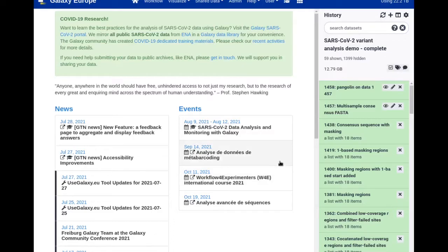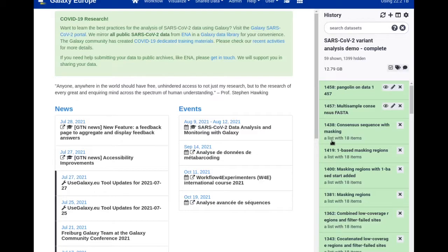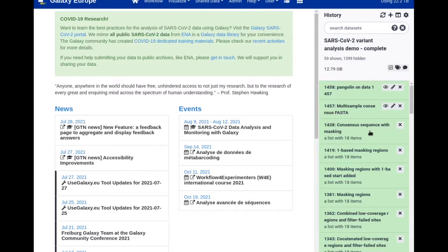If you have been using collections in your analysis, then even the download of a batch of results files is not too complicated. You simply go inside your collection of interest, like I show here for a collection of viral consensus FASTA sequences.